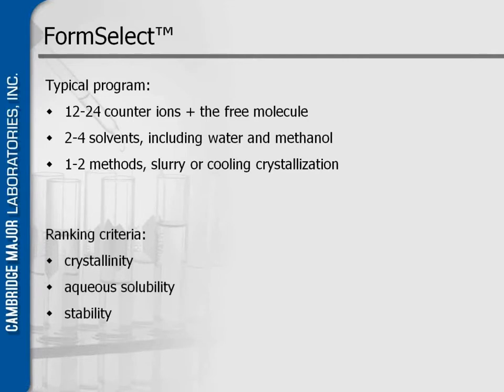The ranking criteria, because you are not putting absolute values there, you are looking at which one is best to take forward. It's very much depending on what you want to do with it. It depends on which property you want to improve. So you can have a look at crystallinity, you can have a look at aqueous solubility, or you can have a look at stability.